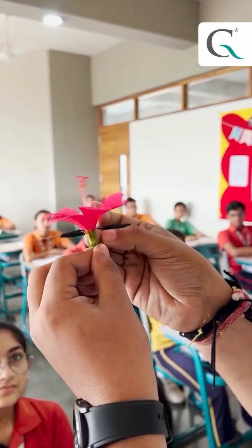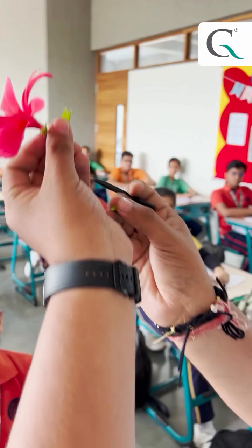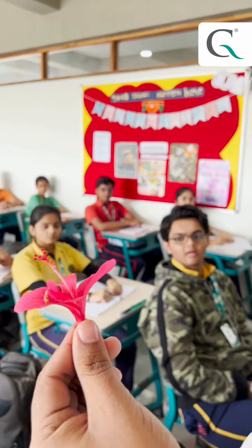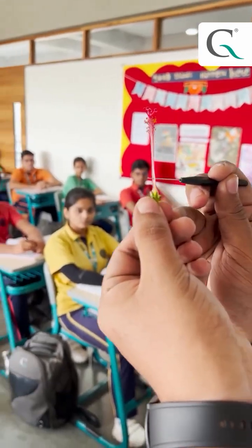So let's remove the other parts. This is the whole intact sepal. Then we will remove the petals, or we can call it as the corolla. The main part over here which we can see.